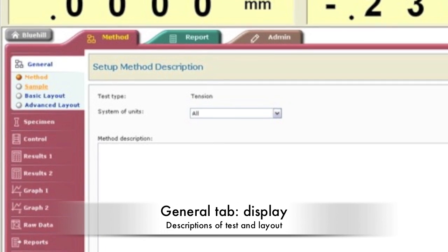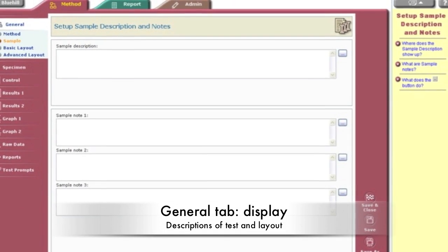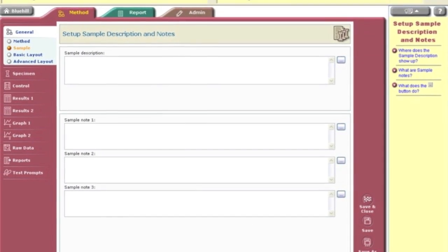The general tab is for display purposes. You can write descriptions about your method and sample and specify the layout of the program.